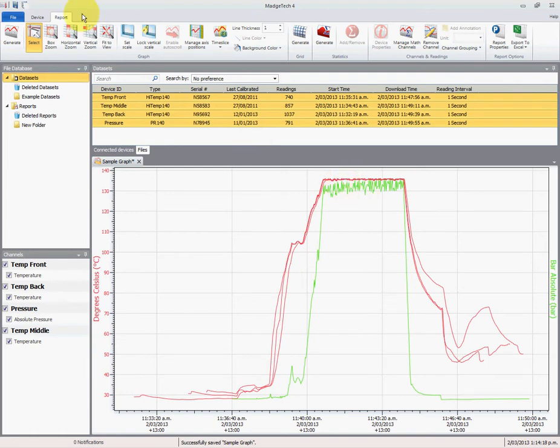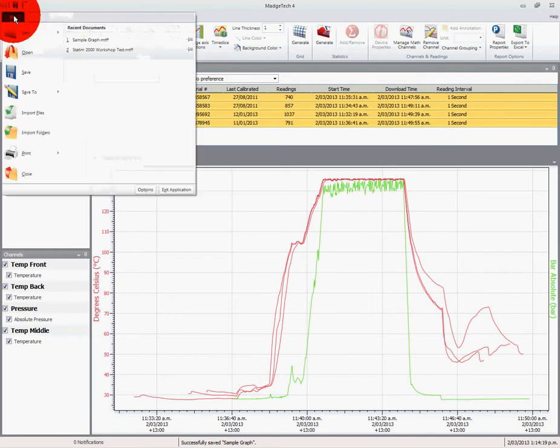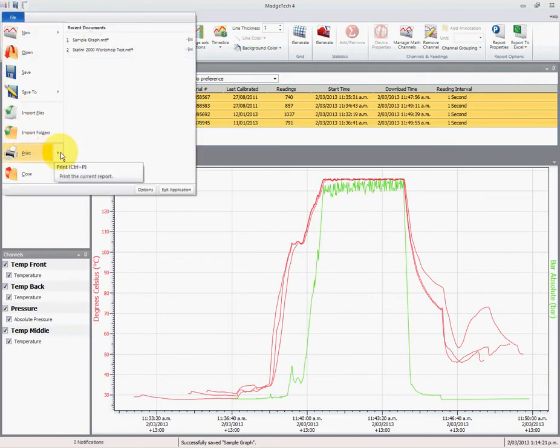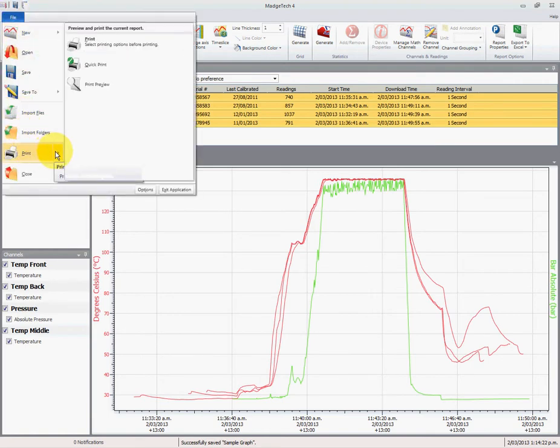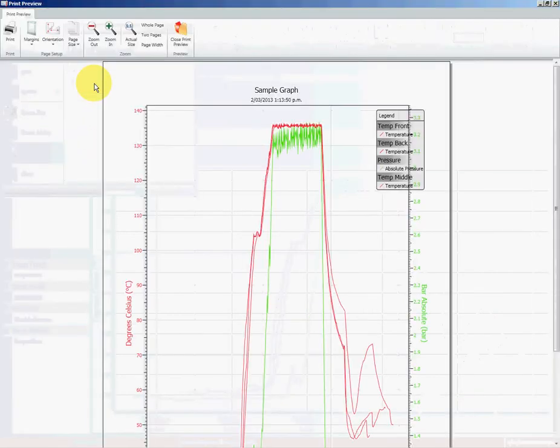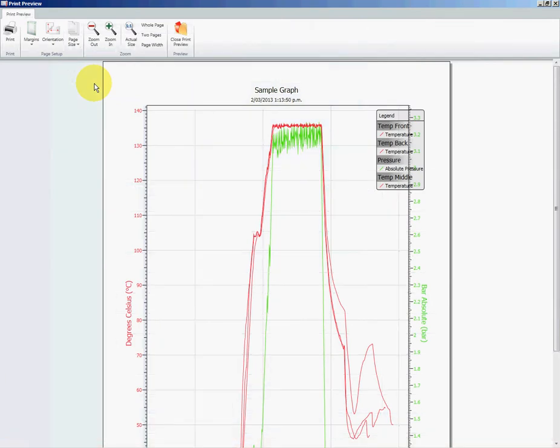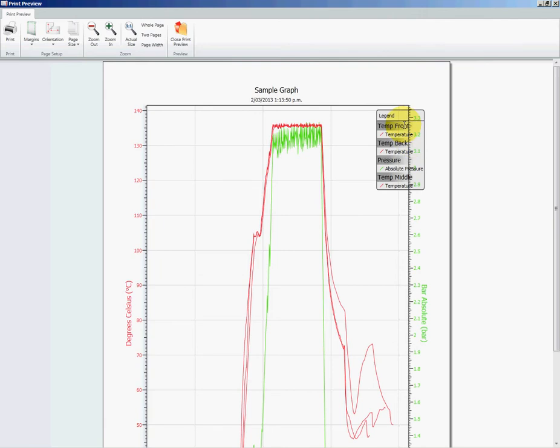If we go to file, print preview, we'll see what this looks like before we do any changes. You'll notice on the right-hand side the legend is obscured over the axis, or the axis is obscured by the legend. So we need to shift both of the axes for the pressure and temperature to be on the left-hand side.